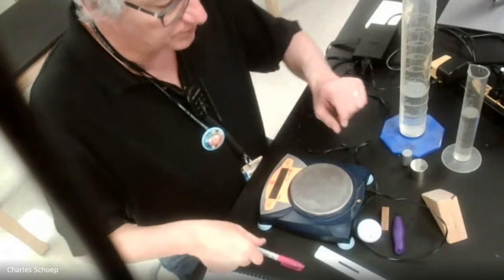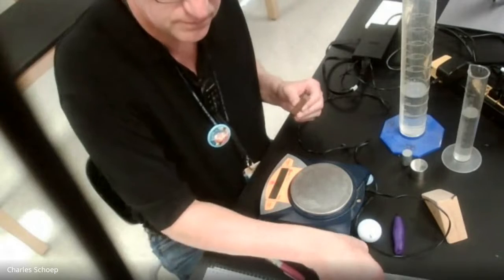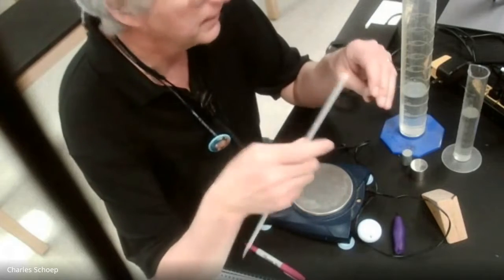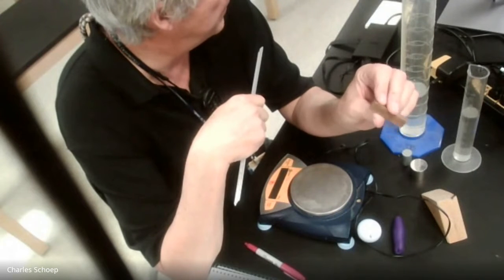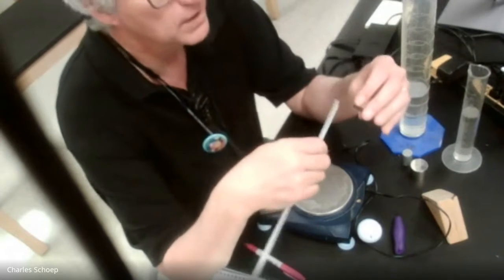All right, let's do the other easy one. Now notice I didn't calculate out the wooden triangle yet. I'm just getting measurements. Guess what you guys are going to do? All right, so we've got our metal cube-like thing here.